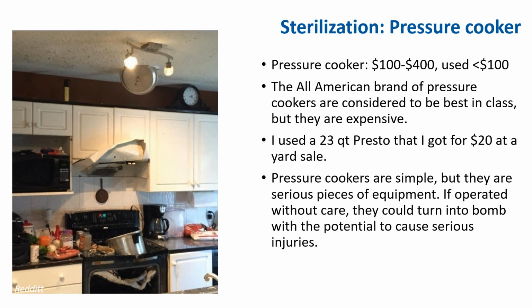USDA does not endorse using an electric pressure cooker to can things. So in general, you shouldn't use this for mushroom cultivation as well. There's some way around it, but it's not as good as the stovetop one.